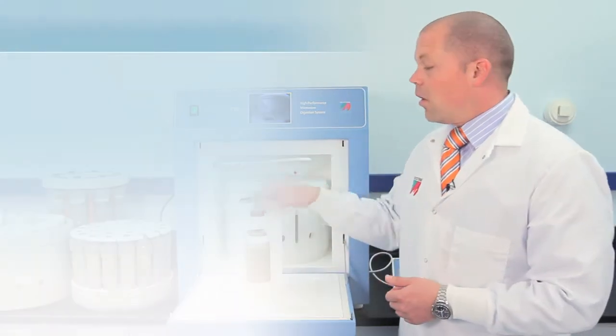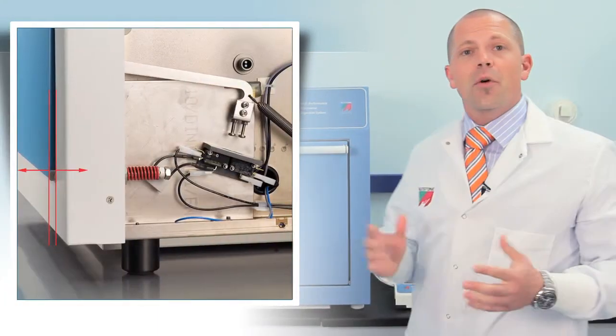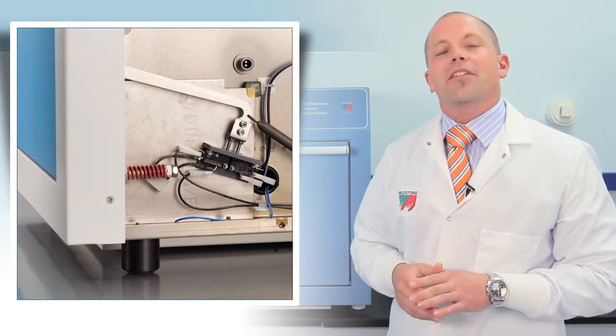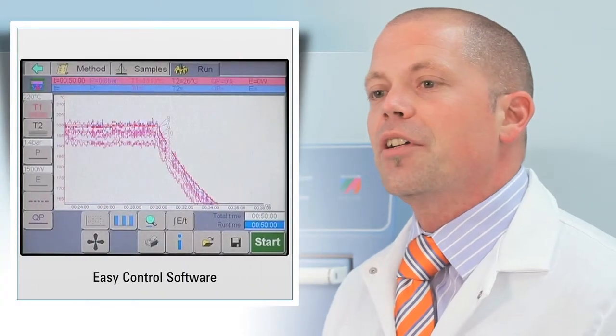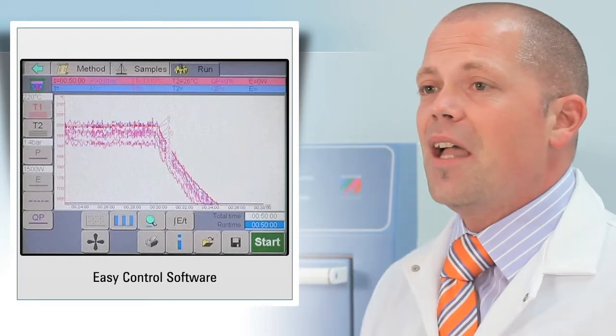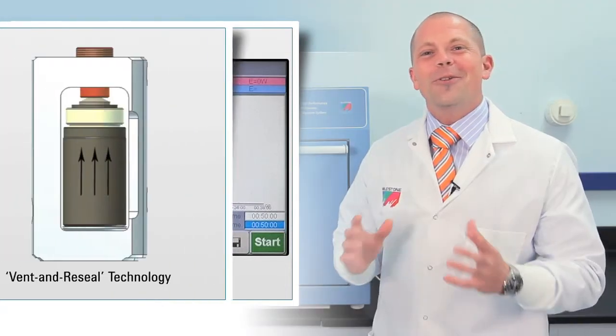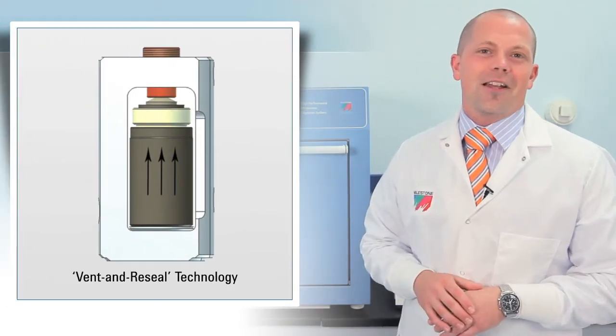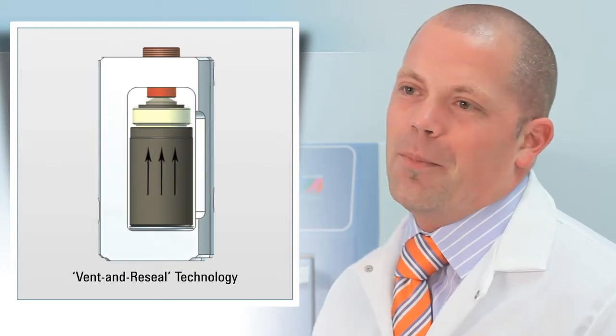And that's the Ethos One. All stainless steel construction, a pressure release safety door, and 5-year warranty against cavity corrosion. Operation is extremely easy with the touch screen controller running easy control software. Its advanced PID control allows maximum reaction control. Milestone uniquely offers true vent and reseal technology which eliminates excessive venting, giving more complete digestions and better data quality.